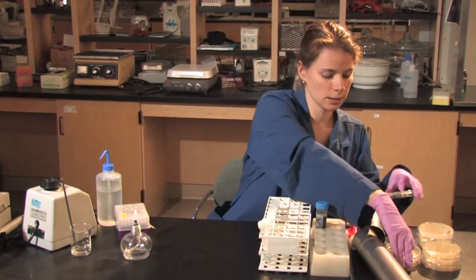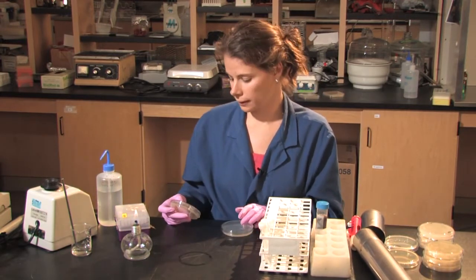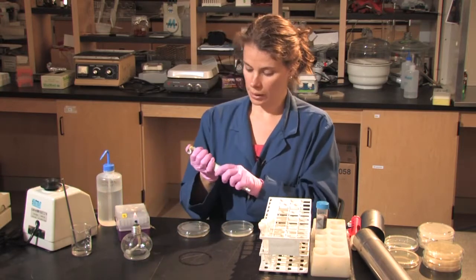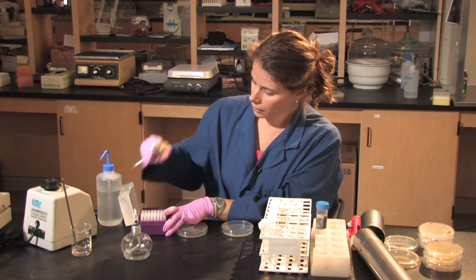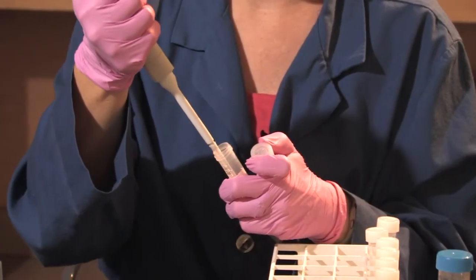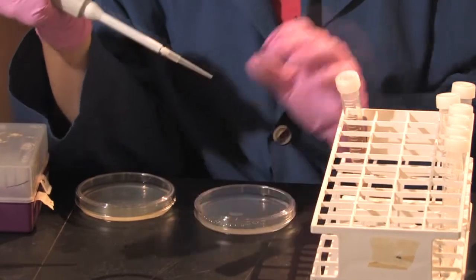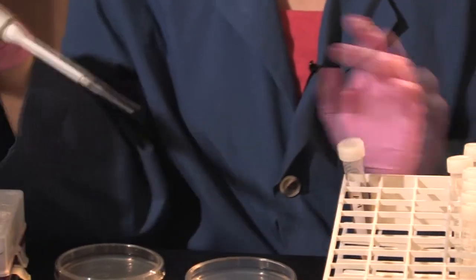I'm then going to plate on two different types of agar: a potato dextrose agar, which is for fungal growth, and a tryptic soy agar, which is for bacterial growth. I have my micropipettor set at 100 microliters, and I'm going to add 100 microliters of the 10 to the minus 1 dilution to each plate — the potato dextrose agar and the tryptic soy agar plate.